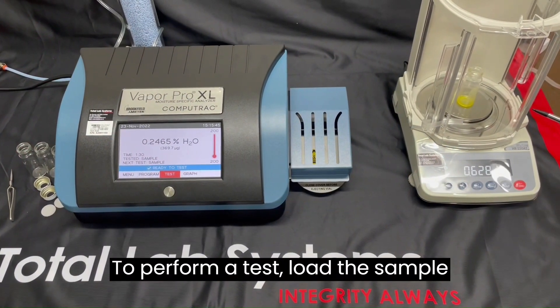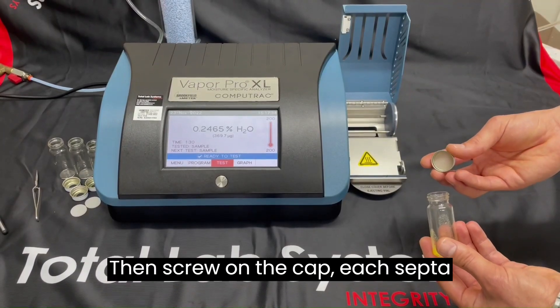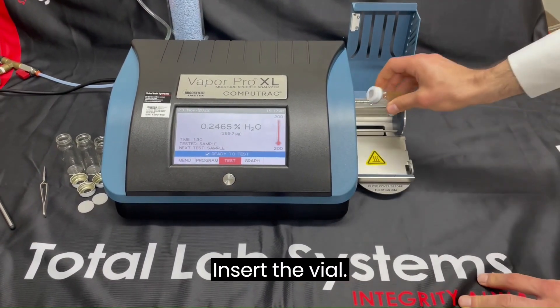To perform a test, load the sample into a vial, weigh the sample, then screw on the cap. Each septa can be used multiple times.